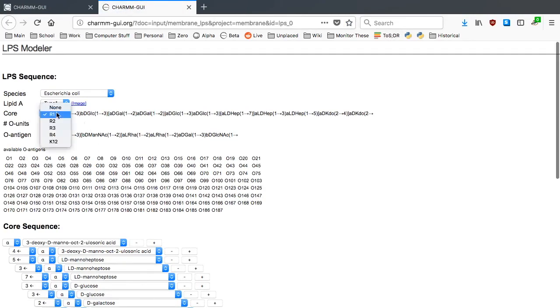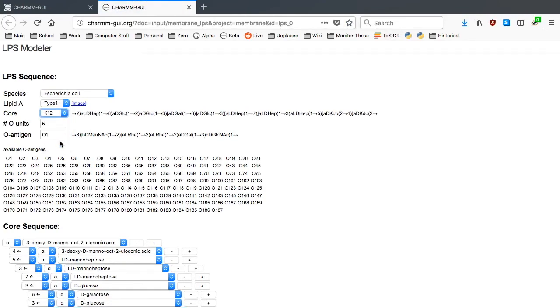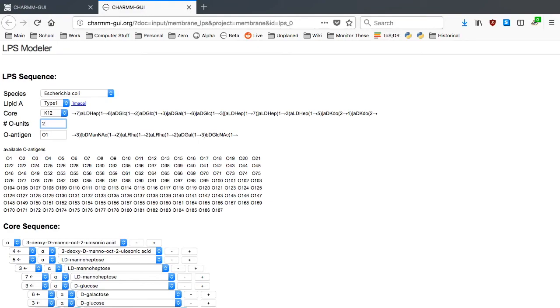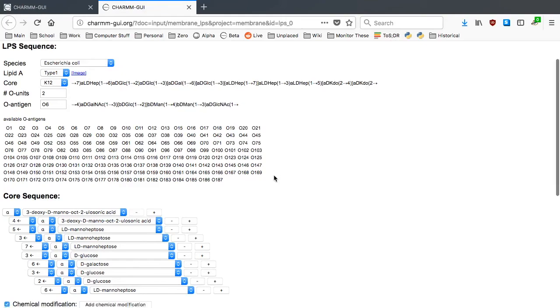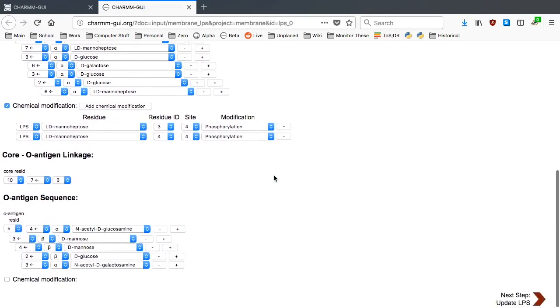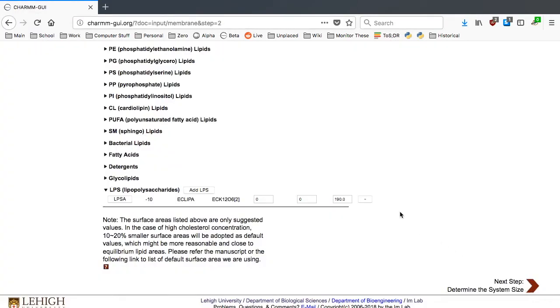Change the core type to K12 and put 2 for the number of oantigen repeating units. There are about 190 different oantigen types in E. coli, and you can change the oantigen type easily by clicking the oantigen name in the available oantigens table. Click O6 in the available oantigen table and close the window by clicking Update LPS.